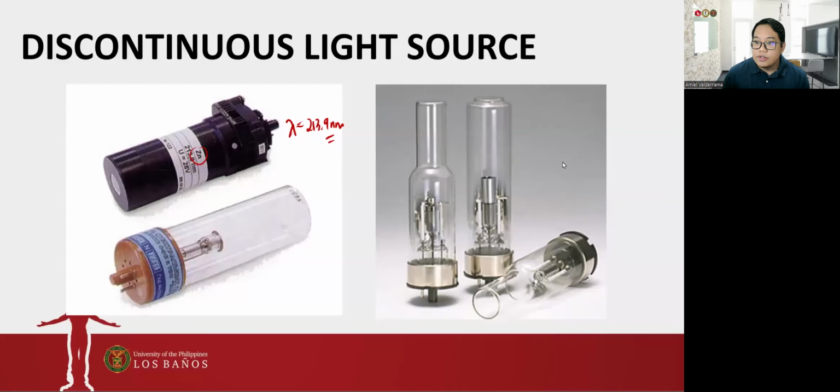Okay? So next naman natin ay after the light source, your light will pass through a monochromator. Okay? Kasi yung light natin ay polychrome light na yan. Polychromated light. Okay? So gusto natin, certain wavelength of light only passes through our sample. So your polychromated light will have to pass through a monochromator para ma-disperse yung ating light into its separate wavelengths.